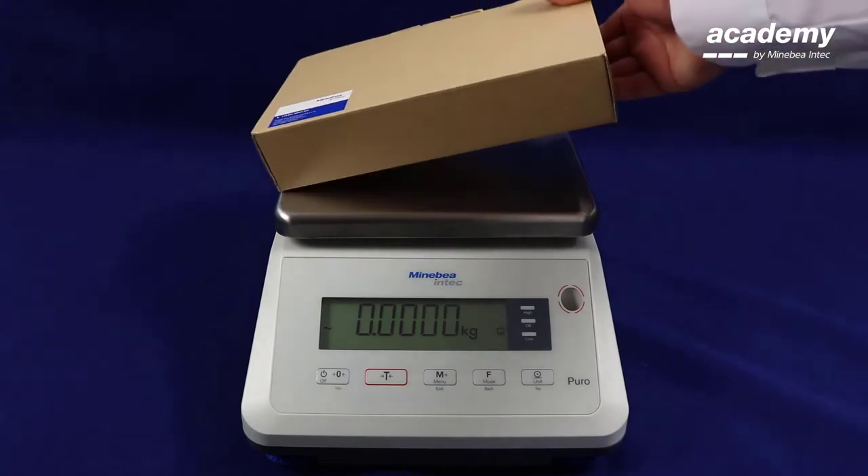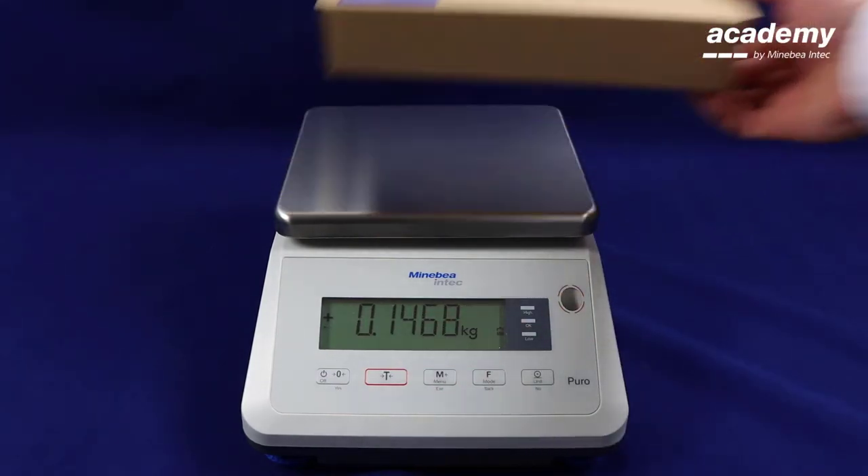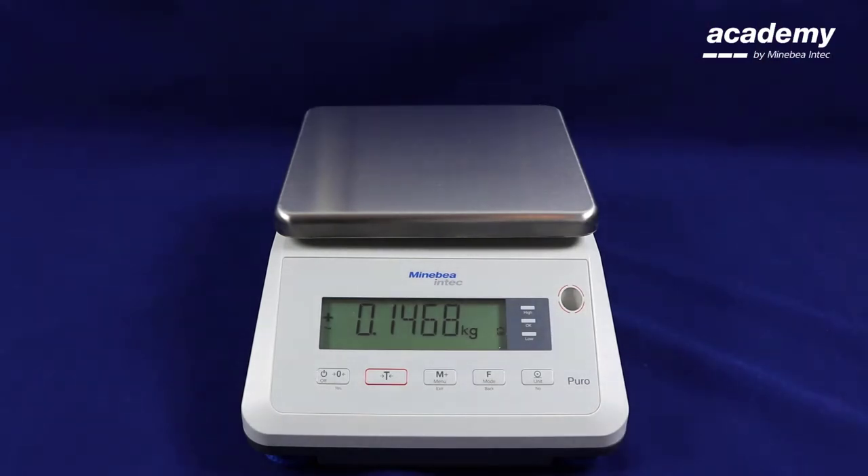Place your weighing sample onto the weighing pan. You can see that the symbol is flashing.